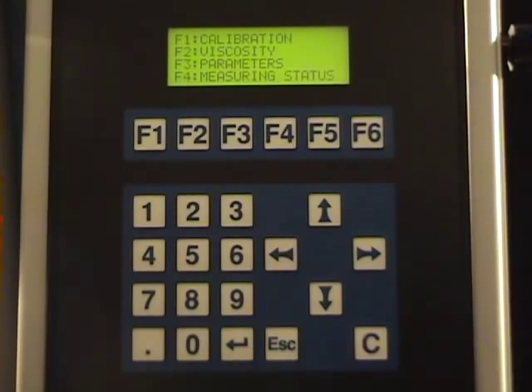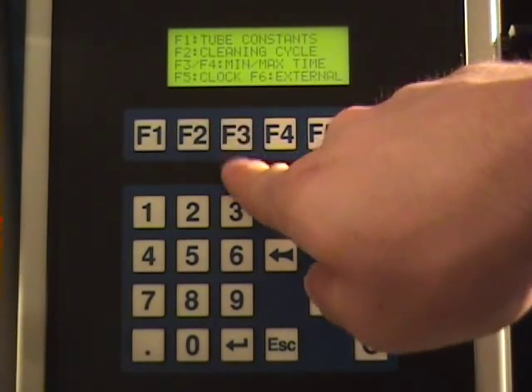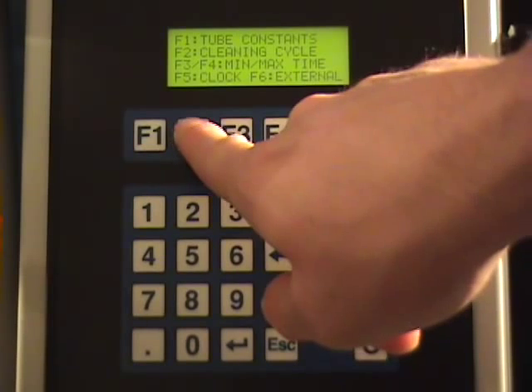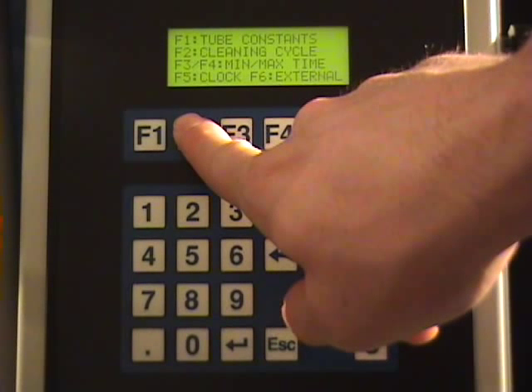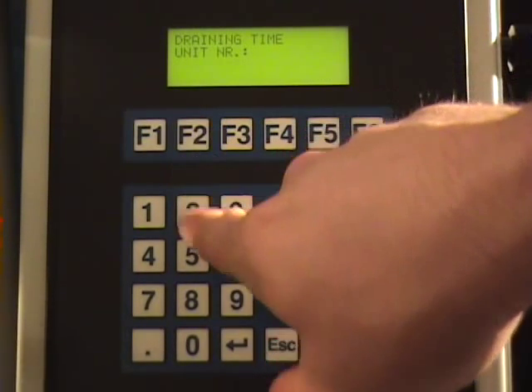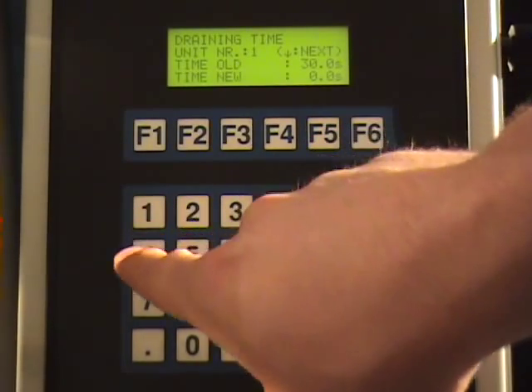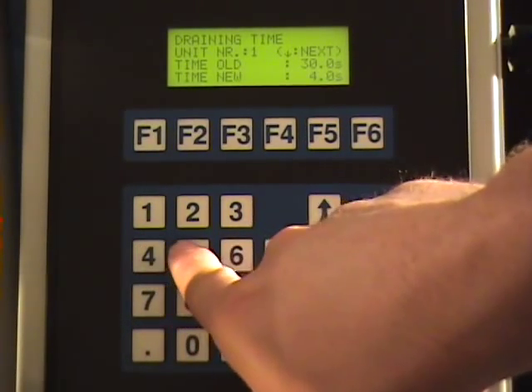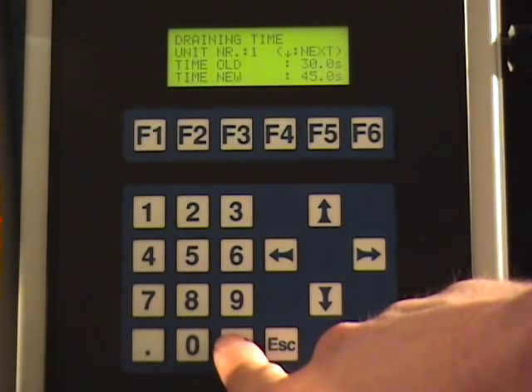Choosing F2 from the parameter menu brings up the cleaning menu. As with all settings, each tube can be separately configured allowing maximum flexibility and customization. First, the initial draining period needs to be set. During this period, the pump evacuates the tube but no solvent is injected.